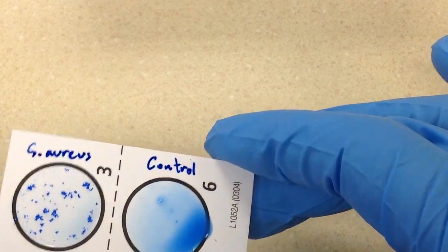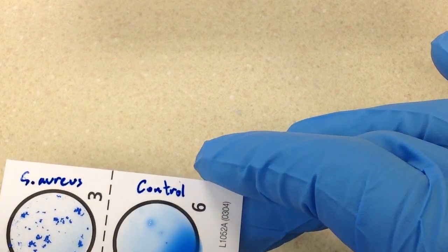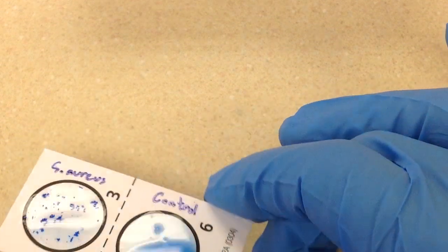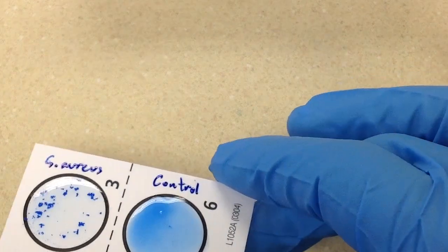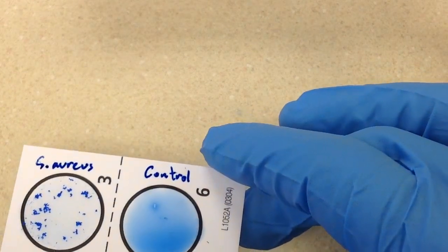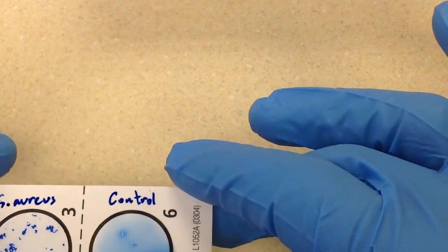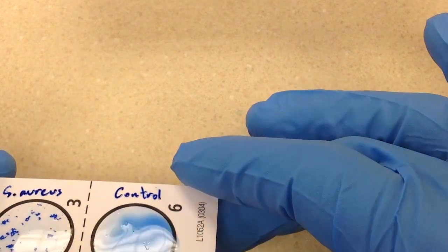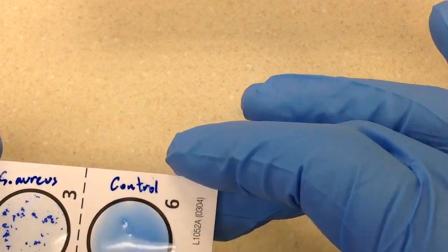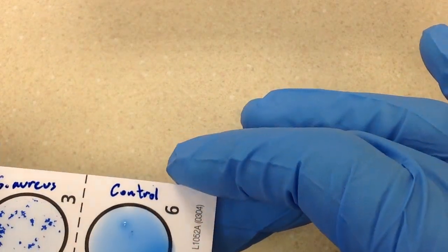It's a positive reaction — we have agglutination and we have a clear background, which makes it strongly positive. Sometimes on the control side, or if you're doing QC with a different organism like Staph epidermidis, you will see some agglutination, but that is not considered positive unless we have a clearing of the background.